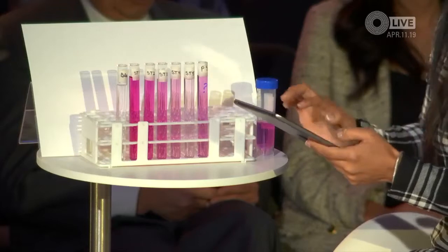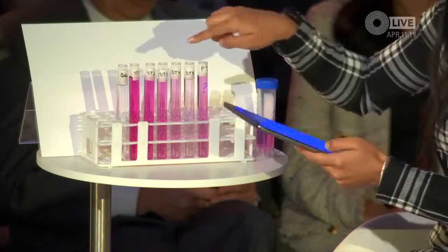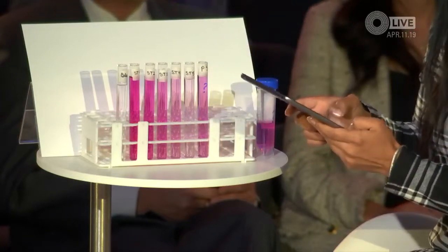This is 0.2. This is 0.1. So are you putting in the concentrations you know? I'm putting in the concentrations that we do know. Right. And we are going to then calculate the concentration of the unknown solution. A colorimeter, for example, normally costs $500, but here, just with an app, you will be able to calculate the concentration of this unknown solution.